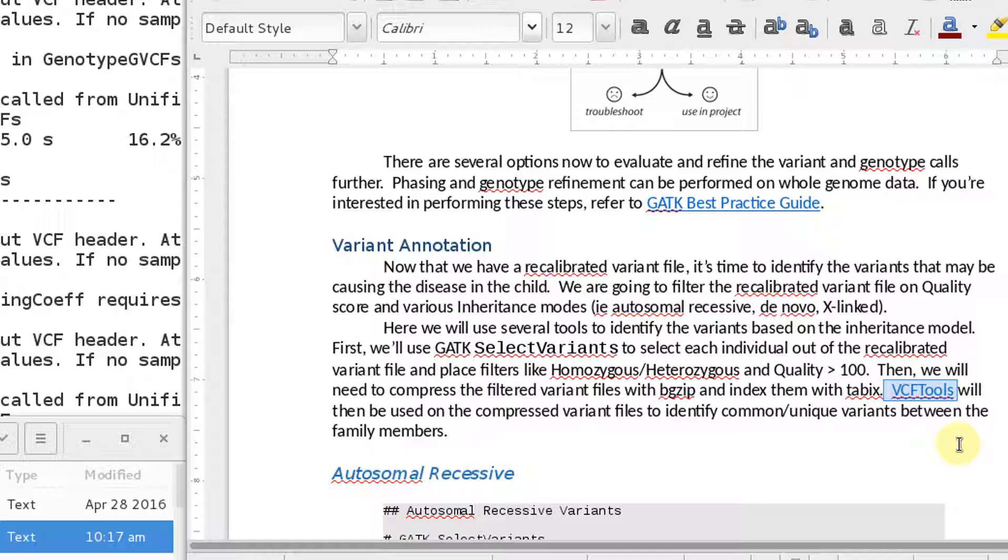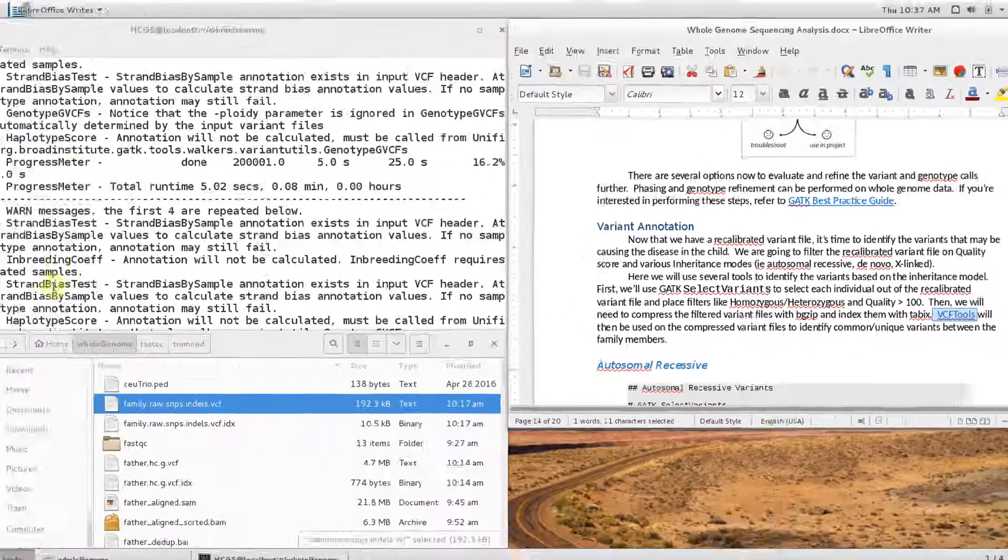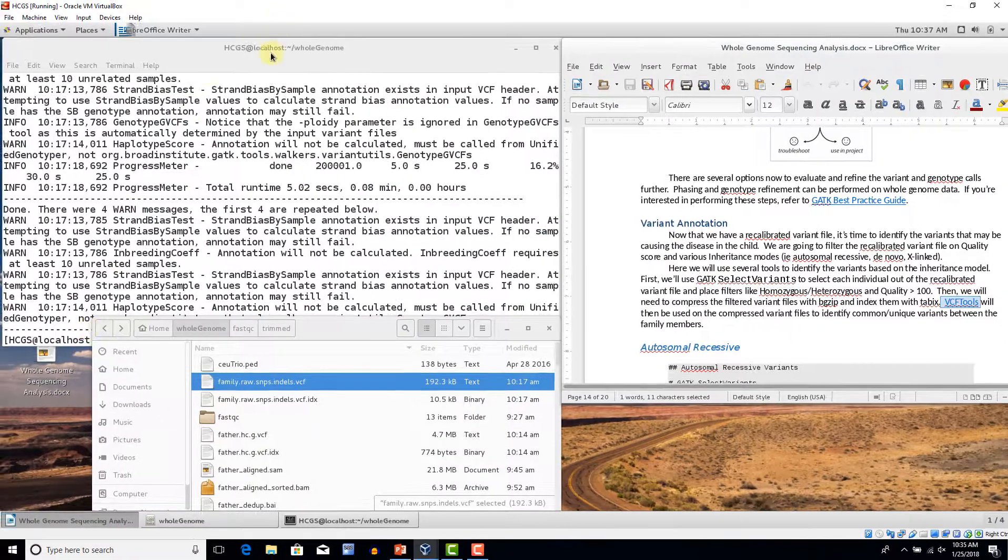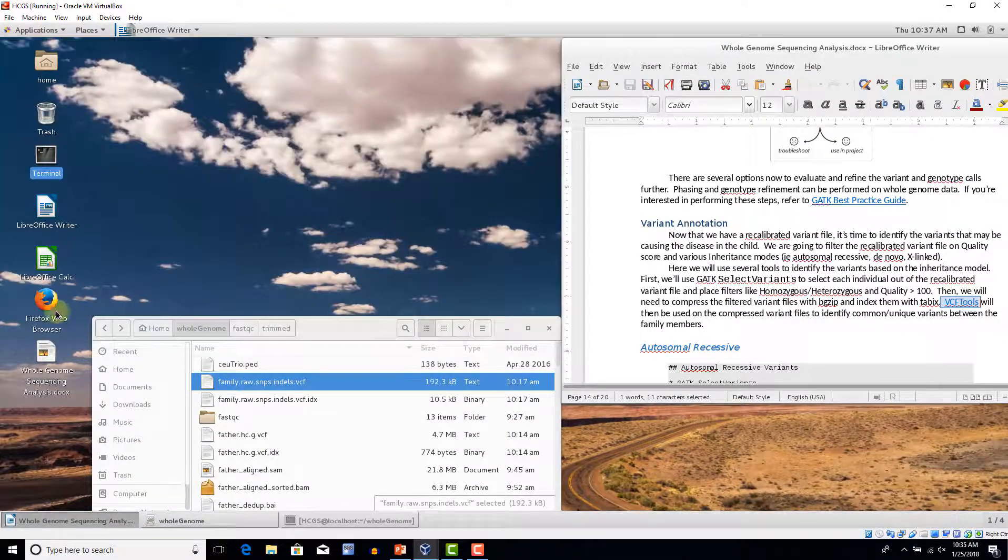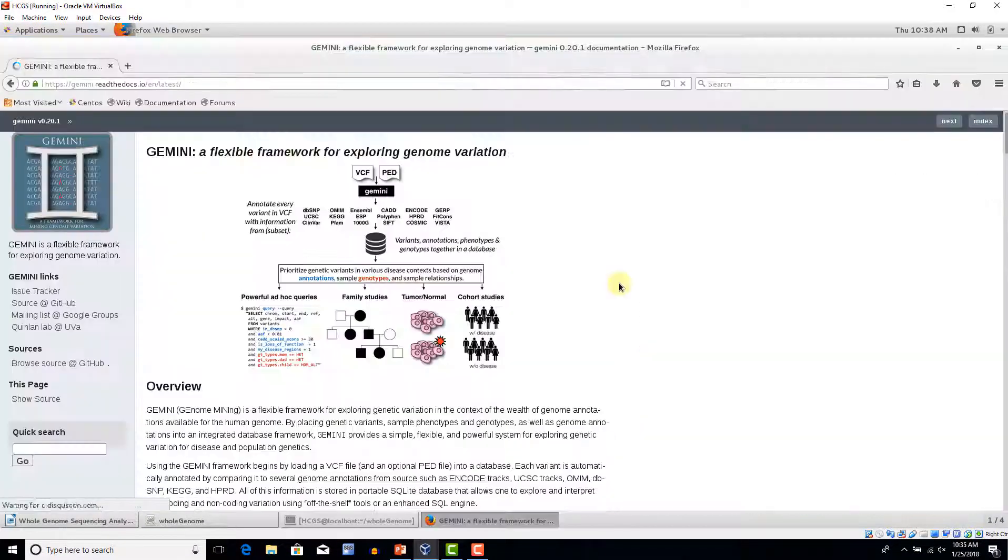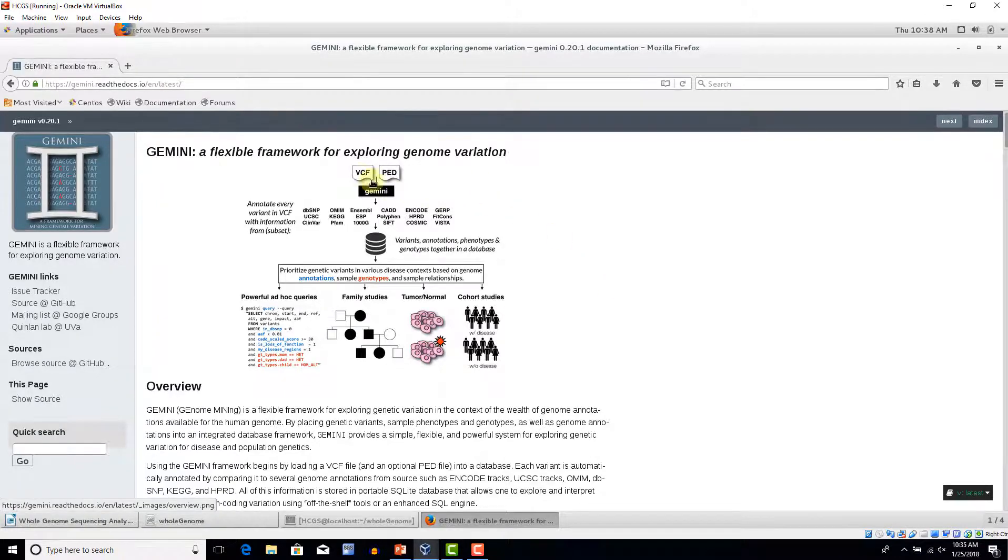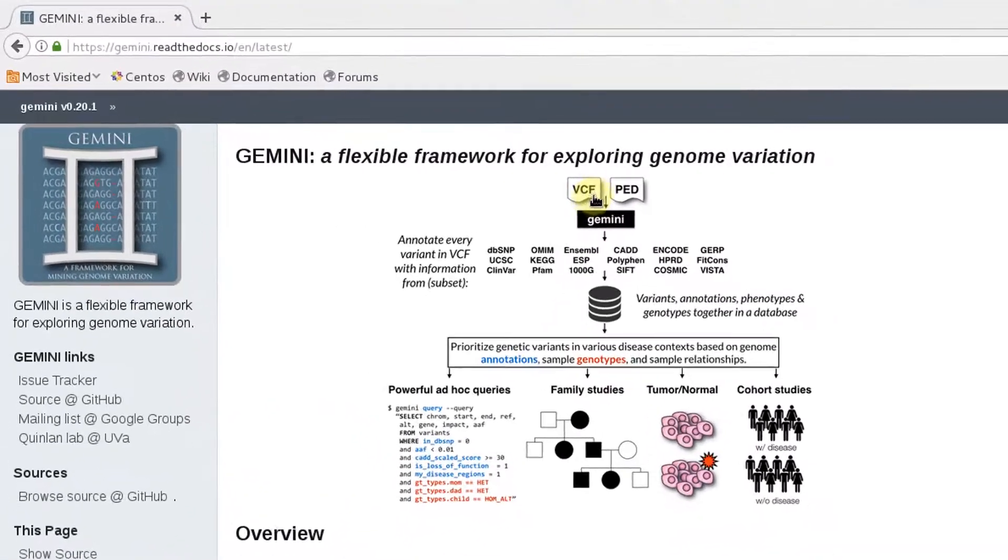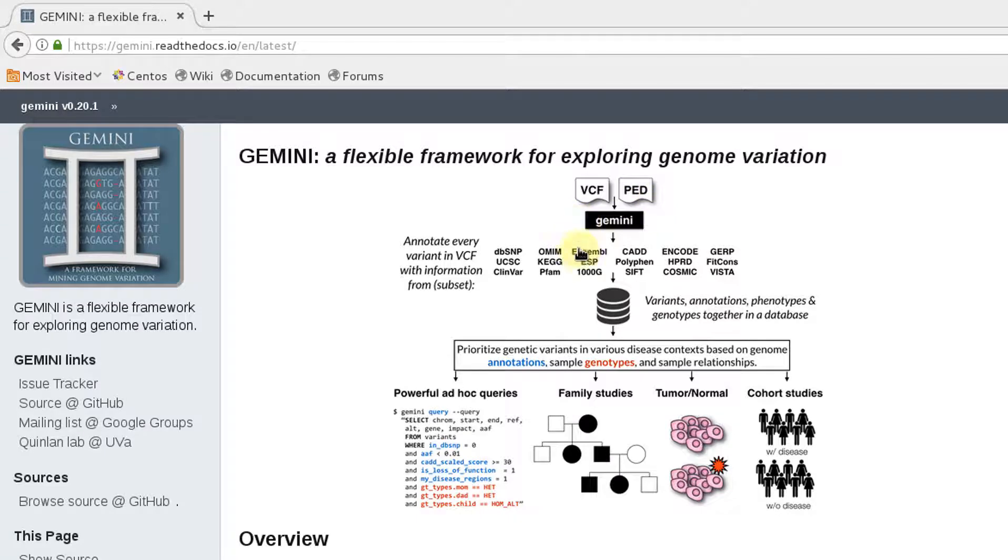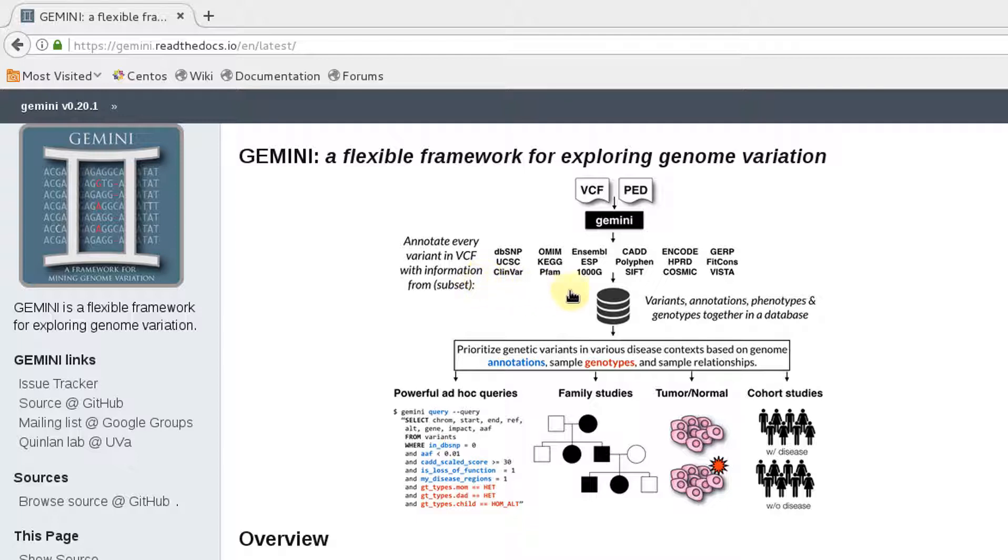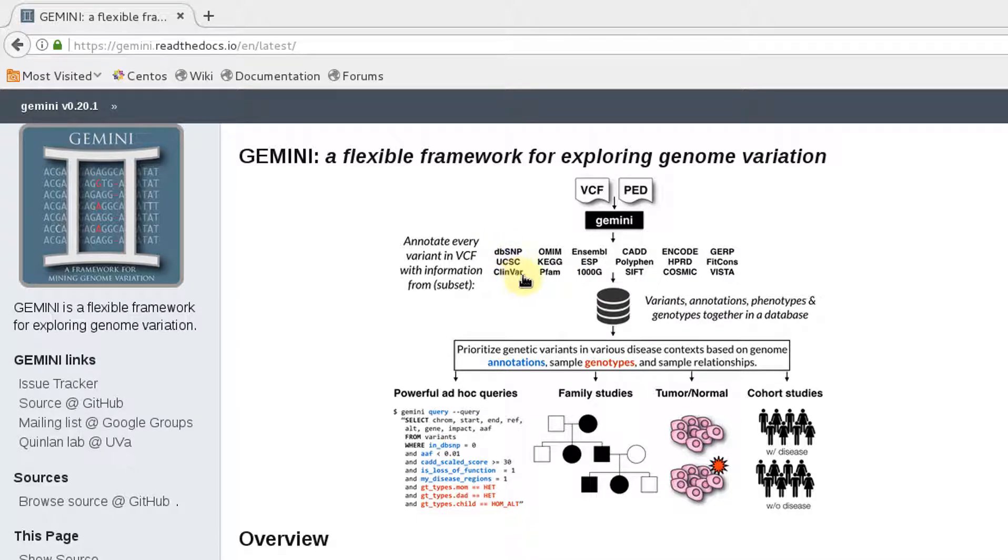There are better tools out there that can help me identify the recessiveness, the de novo, X-linked, and so forth. And one tool that I highly recommend is called Gemini. So Gemini is a very powerful tool that allows you to input your variant file, along with your pedigree file. And it comes in and it annotates everything based off of these various databases here. So dbSNP is included, ClinVar, OMIM, KEG, Ensembl, Thousand Genomes, CADD scores, PolyPhen, SIFT scores.